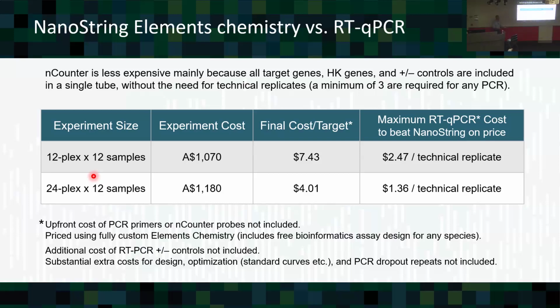You could order any variations and look at these crazy ideas, and you think people would. If I was in the lab, I would have. But people just like to pay their money, get their result. They don't really play in the lab very much. But there's no reason that you couldn't, with some great ideas, do something really amazing with modified bases, for example. Yeah, 100%.